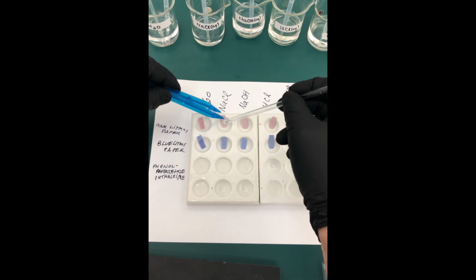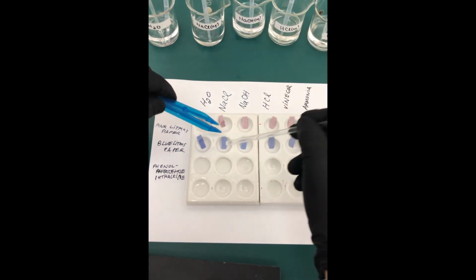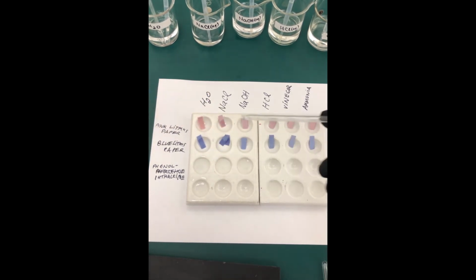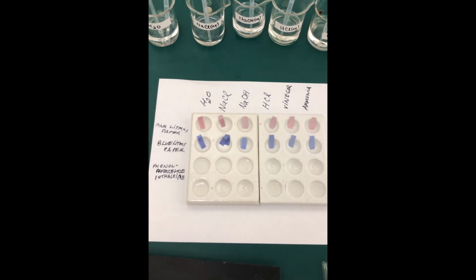All right. Let's test out the NaCl solution, sodium chloride. Start out with the pink litmus paper. And then do the blue litmus paper. Oops, sorry, apparently I had 2 of them in there by mistake. Okay, there you go. Apparently I had 2 pieces of litmus paper stuck together. Again, notice that it does get a little darker because it's getting wet, but that doesn't represent a change in color.